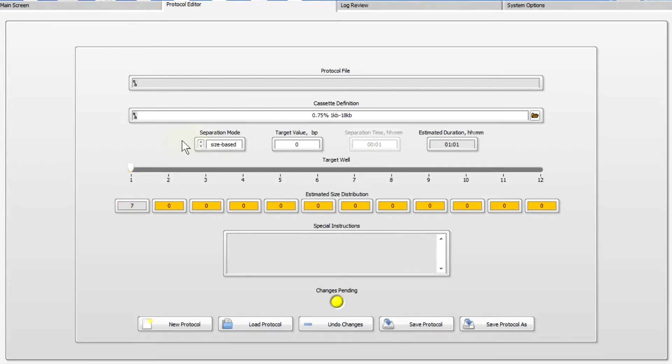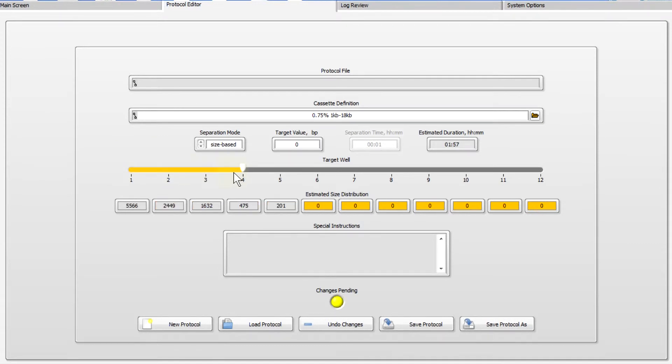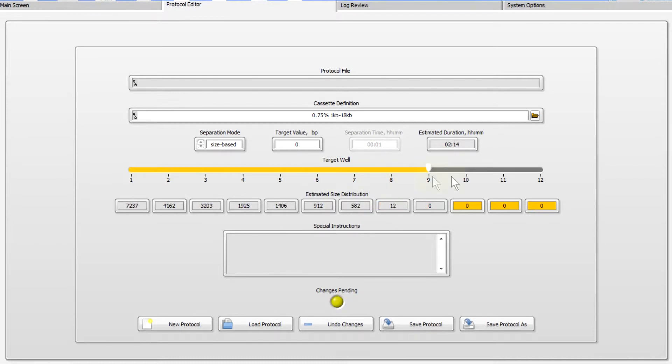It's designed for users for whom the accuracy of sizing is less important, or users who do not wish to use an internal standard. Move the slider to select a target well and enter a value for the average fragment sizes.